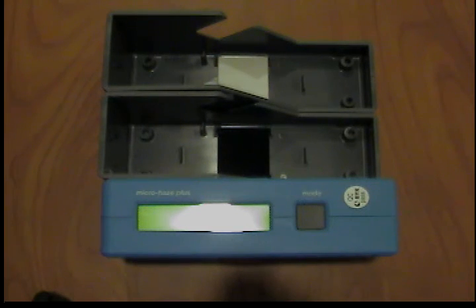For the calibration, the unit is provided with two holders, one of which contains a black glass standard for gloss calibration, while the other contains a white ceramic standard for haze calibration. Make sure before the calibration that the standards are clean and without scratches.